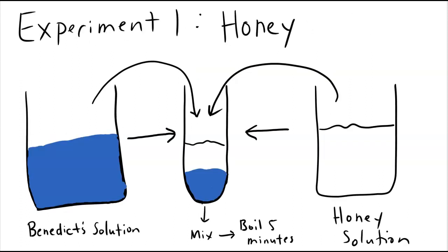Like in other previous virtual labs, I'm going to run through a couple of scenarios that we would have actually performed in class, but now I'm just going to show you the reaction and I'm going to have you record your results in a table and think about the results on a Google Doc for the experiment today.